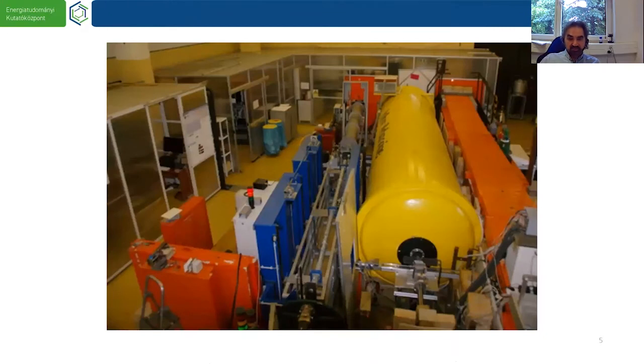So the basic instrument of neutron scattering, at least in our neutron center, is the small angle scattering machine, and this big yellow tank is actually the small angle scattering diffractometer. It is called Yellow Submarine. We cannot probably read it from this side, but we will see other pictures.